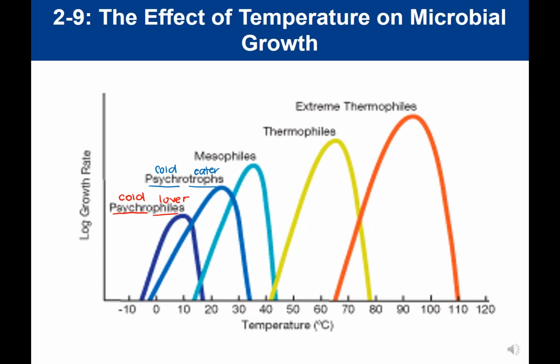They will grow at refrigeration temperature. So around 5 degrees, they can still grow. However, they don't grow well at human body temperature.